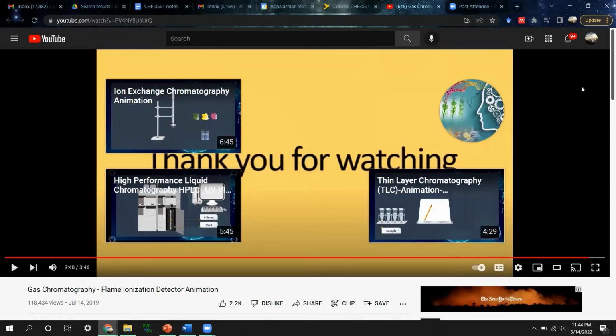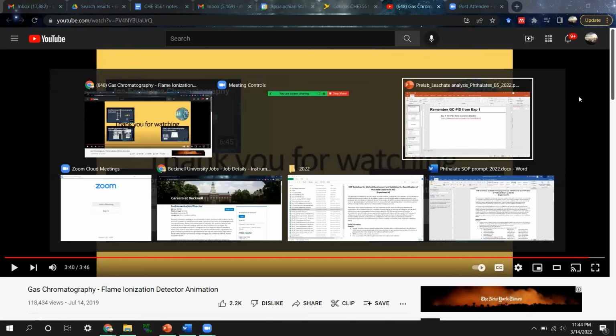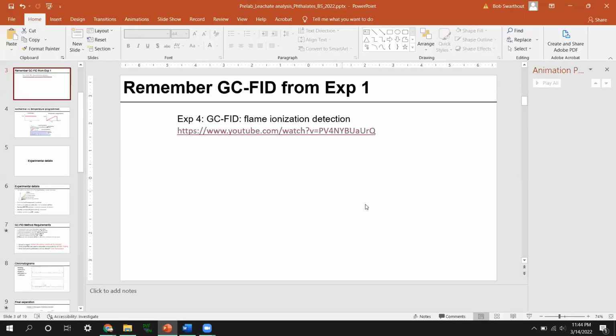All right, so please forgive the automated voice there and the horrible pronunciations of words; chromatogram is not a chromatogram. But the animation there is probably the best that I've seen. So hopefully it gives you some refresher on how GC-FID works. So let us get back here.